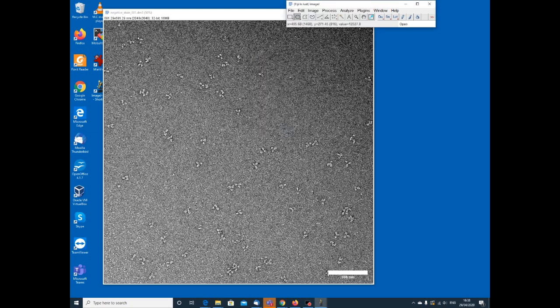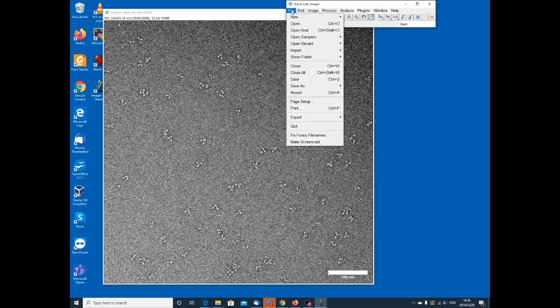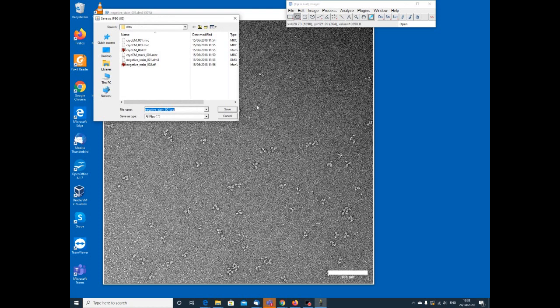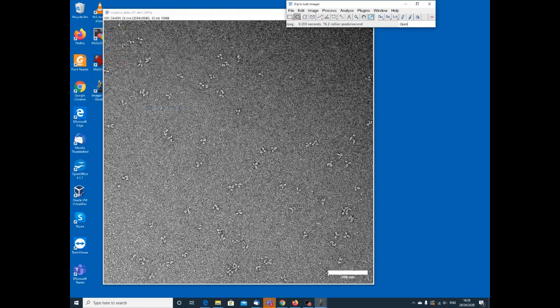So if we save that image now, we're going to save the scale bar onto it. So we go to Save As, so you can change the format to JPEG, and here we go. I'm going to put scale bar on it so that we know that it's different. It's an altered image. We don't want to lose our raw data, or too much, so we might want to use this image for something else later. So if we've got the disk space, it's good to do that.